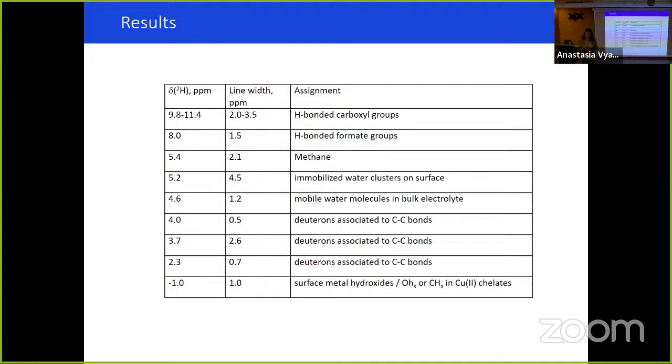And then another related question. Your proton NMR on the collagen side was very broad, right? On the y-axis? Because I think there are many different protons, water inside, exchange, and so on and so forth. But I guess you can improve the resolution on that side, right? In theory, can you see analytes in that phase? Imagine that I put some small molecule in the collagen side at a decently high concentration. Can you then see selectively the CP, the polarization transfer of the small molecule to the solid inorganic phase, or is that too much to ask?